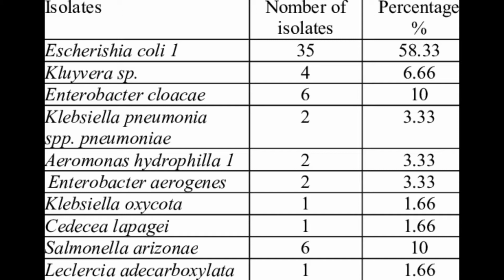Their procedure is to get one loopful of the test organism and inoculate the slant by simple streaking only. You can use a wire needle. Get the inoculum and streak the slant. If it is positive, you get a blue medium and growth on the slant, from the NaHCO3 and NH3 produced, an alkaline reaction, hence the blue color. The negative is a green medium and no growth on the slant.